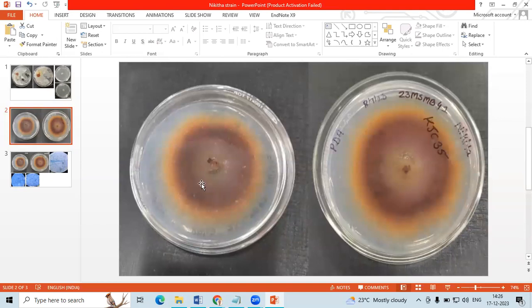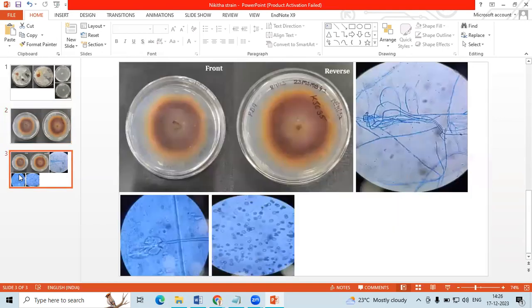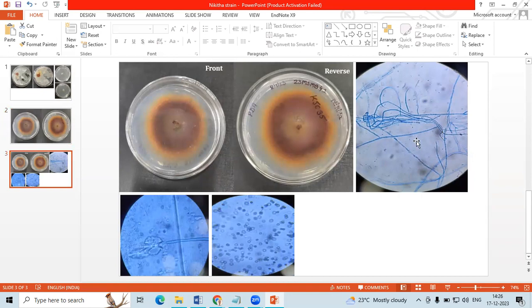Here we have third day plate and here it is, the plate that has been subjected to lactophenol cotton blue stain. Typically, a typical of an endophyte, though it is an epiphyte here, we cannot find a fruiting structure.